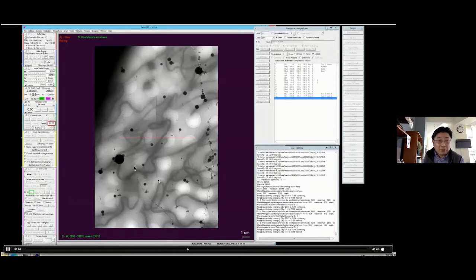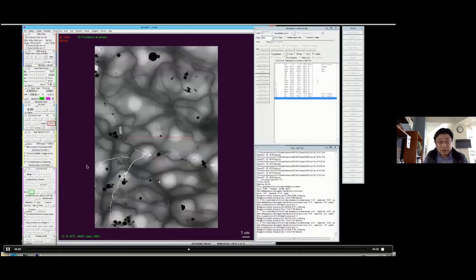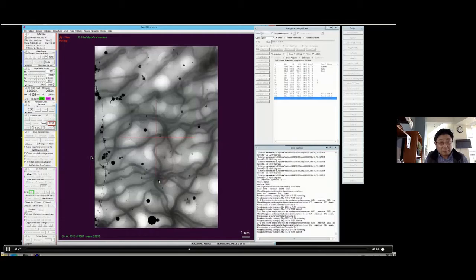Because we use the energy filter, we have to do this zero loss peak. And this is actually important. I think during this demo, I did that one. You will see, at some point I did this energy filter zero loss peak. So make sure that the slit for the energy filter is in the center.